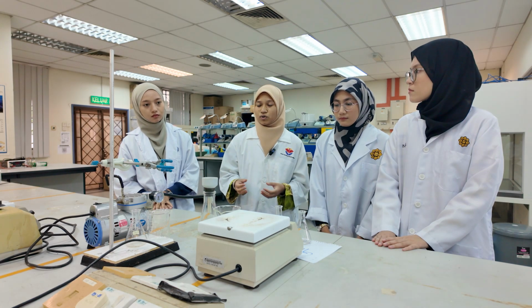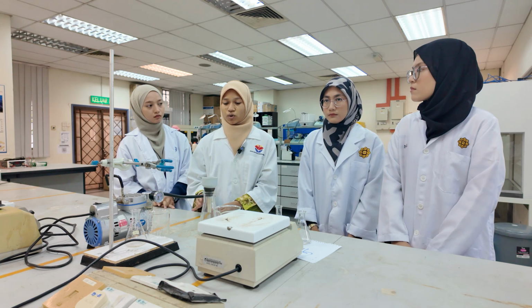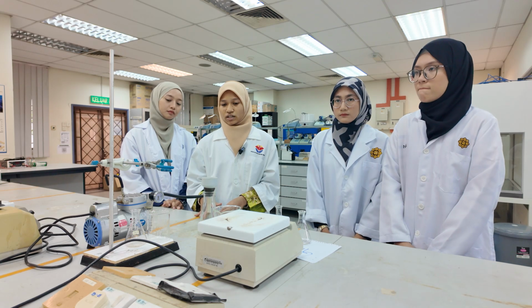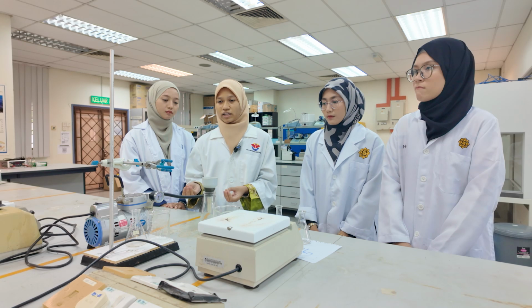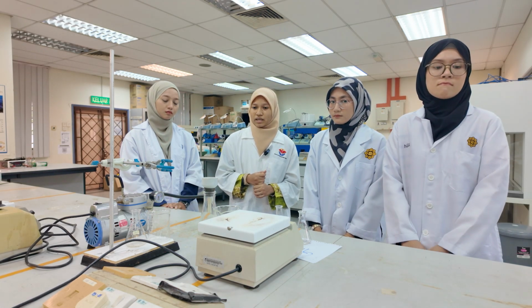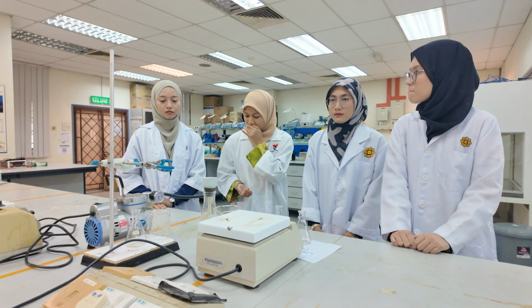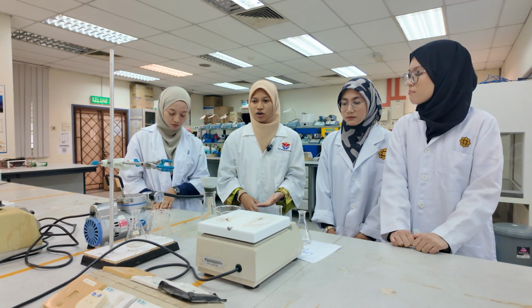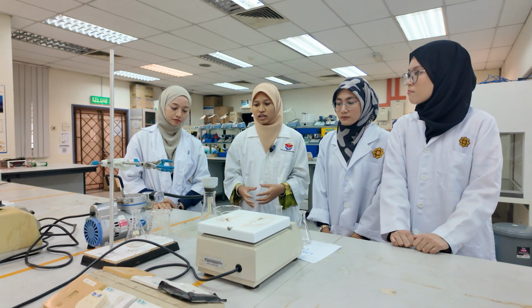For azo dyes, recrystallization is used to ensure that there are no amounts of impurities in the crystal, so the product is a pure dye. For example for color, it has a consistent color. If we don't have a consistent color, it will affect the color of the dyes. So we need recrystallization to remove the impurities in the system.